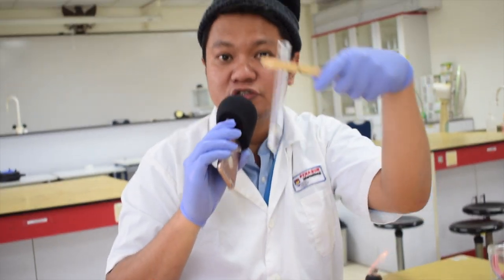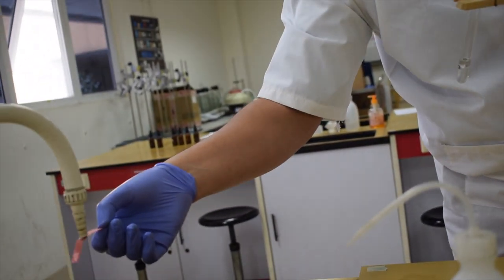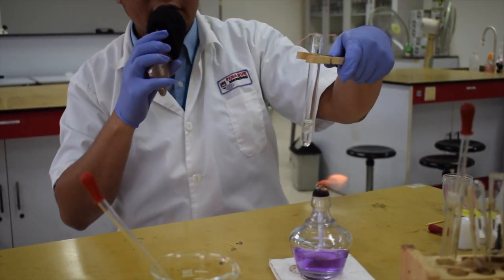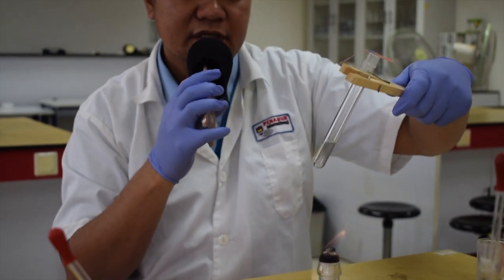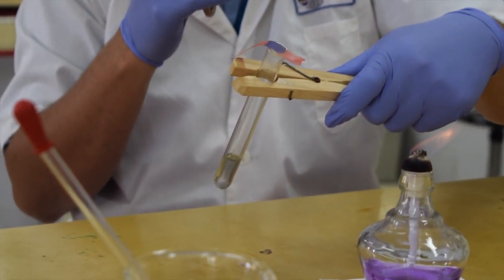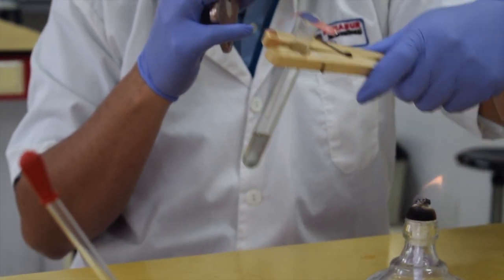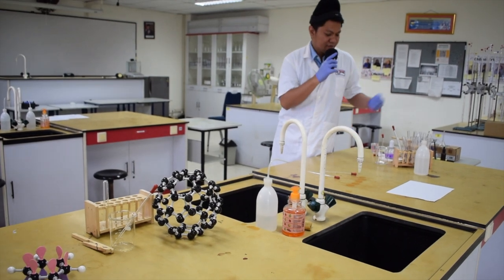We need a damp litmus paper again. Heat the mixture — it turns the litmus paper blue. There are three observations to write in the column: one, bubbles of gas are produced; two, the aluminum foil turns black and is consumed; and three, the red damp litmus paper changes to blue. These three observations each earn a mark for testing nitrate ions.